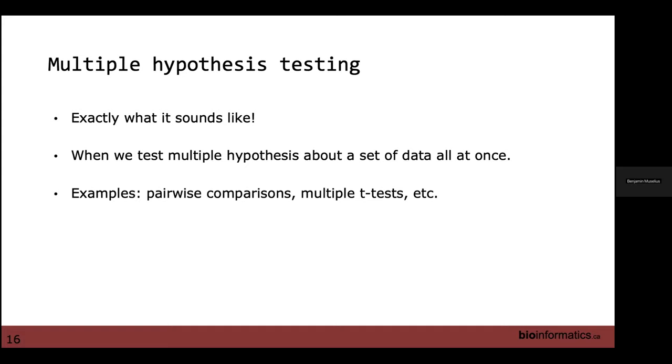I noticed that we have, let's say, 10 treatments. And some of them produce a significant effect, let's say a visible effect. But if you modify which treatments to include in the ANOVA analysis, the significance of those results changes, but the average is still the same. So can you provide some insight?